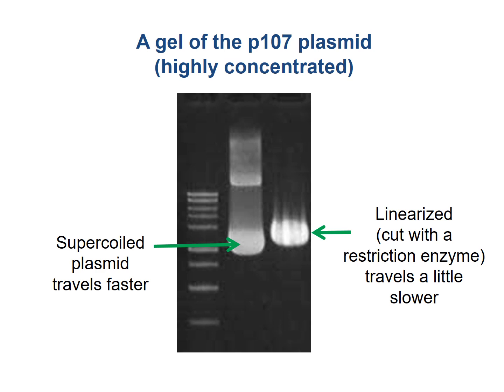Here's a gel of our plasmid. It's highly concentrated. You can see right here is a supercoiled version. Supercoiled means it kind of looks something like this — compacted in the cell. The one on the right is linearized, so it's a little bit more floppy. So it runs a little bit slower on the gel.